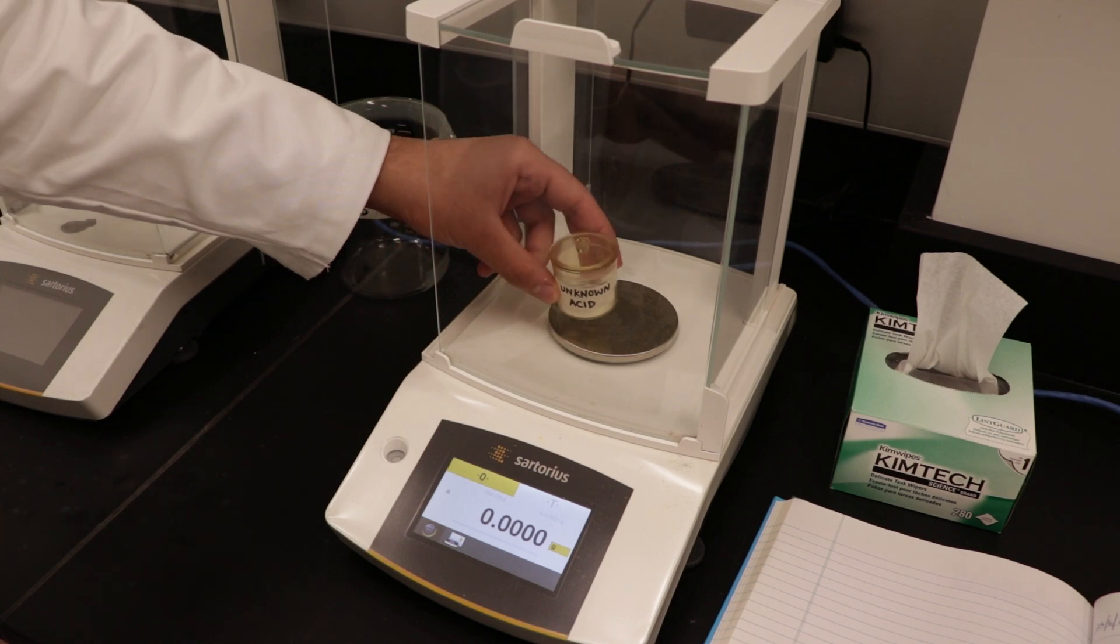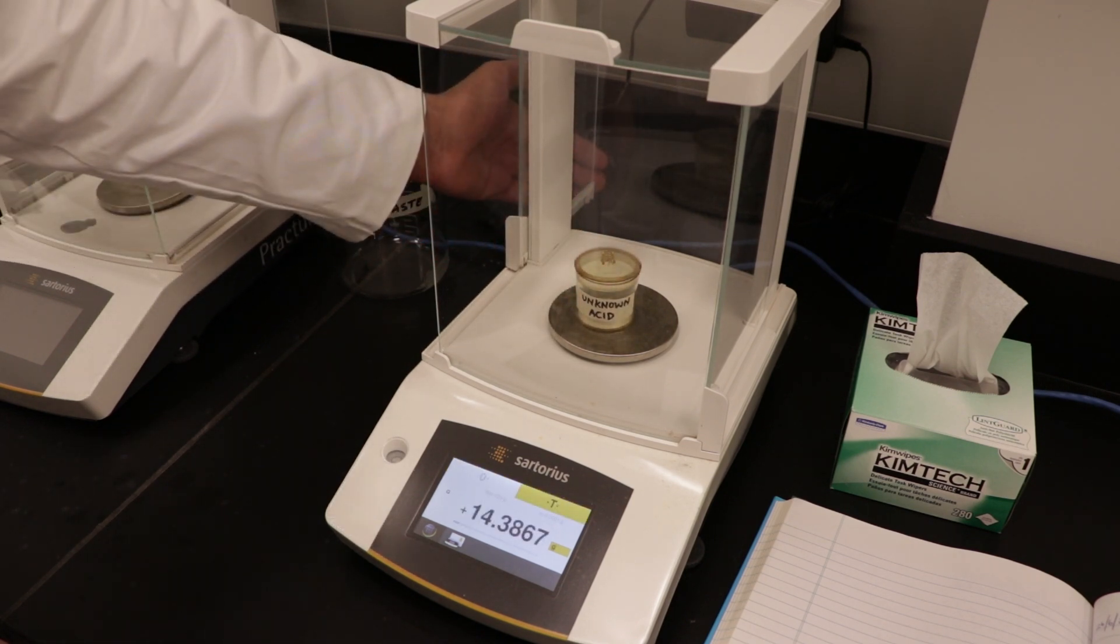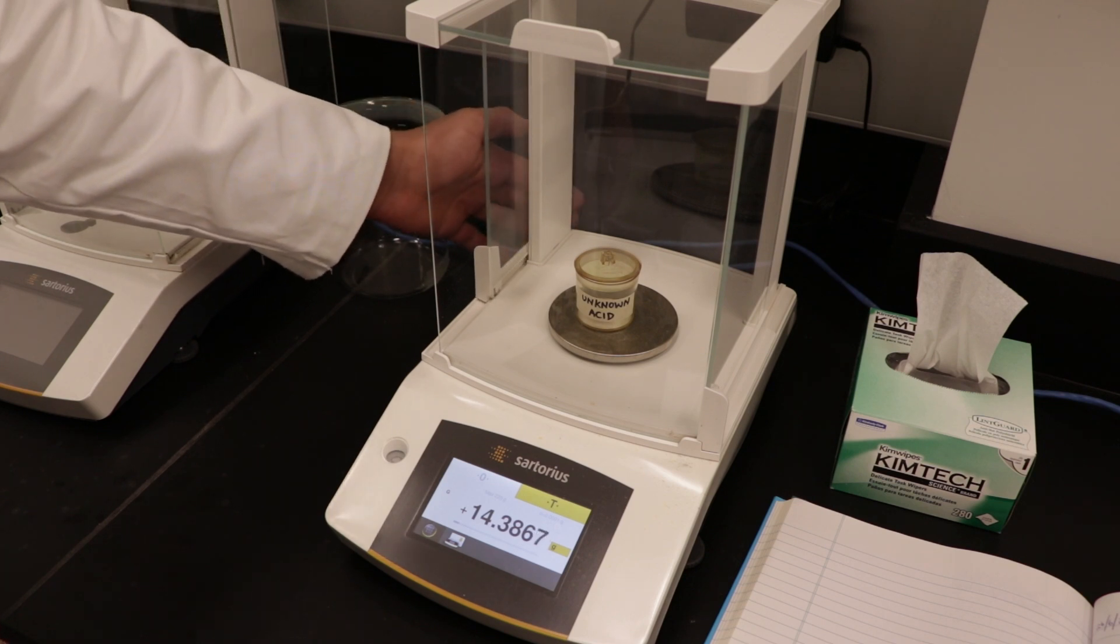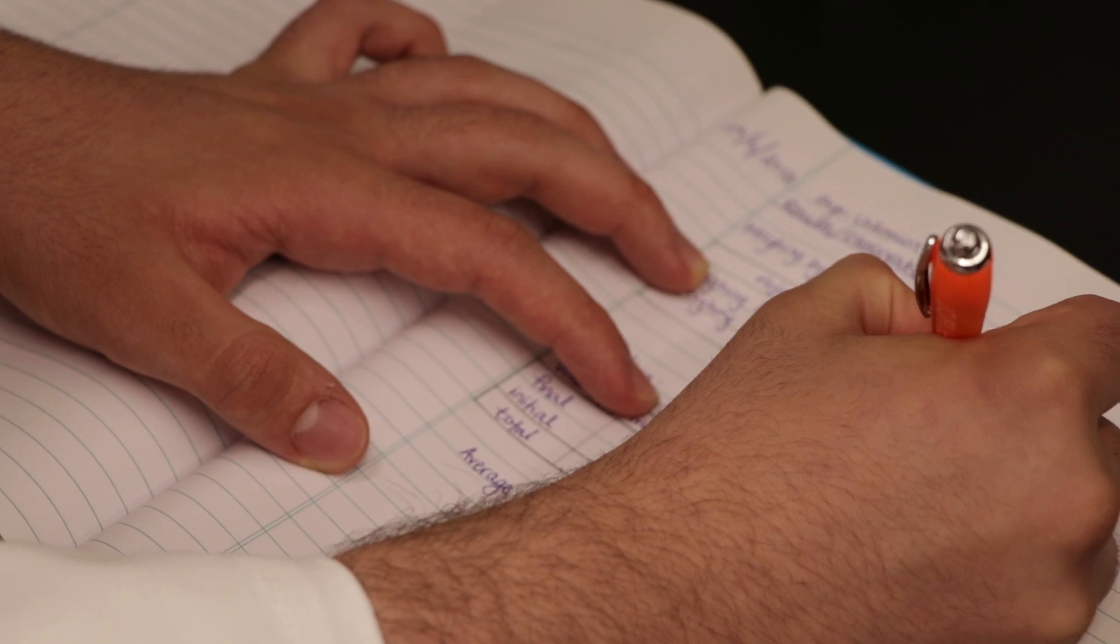Carefully place your weighing bottle with the lid on inside and close the doors. Allow the reading to stabilize before recording it in your lab notebook. Remember to record the weight to four decimal places.